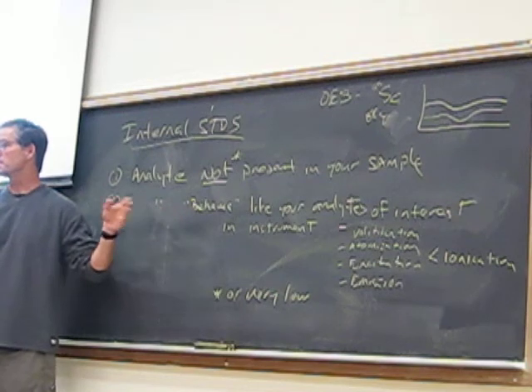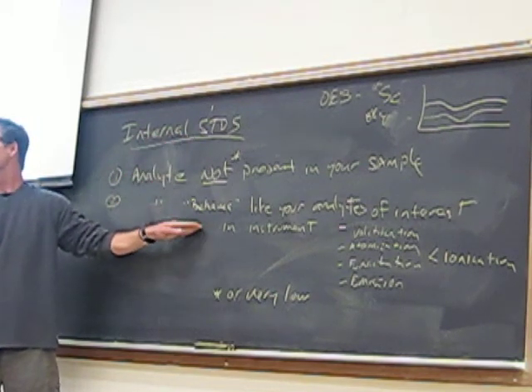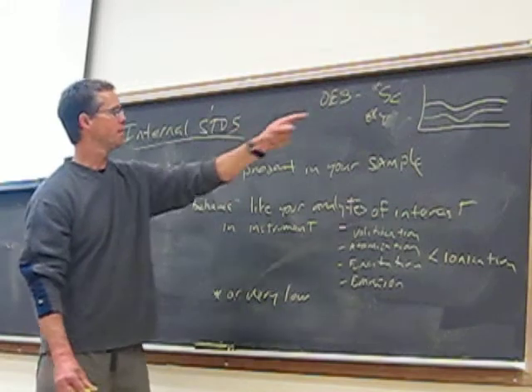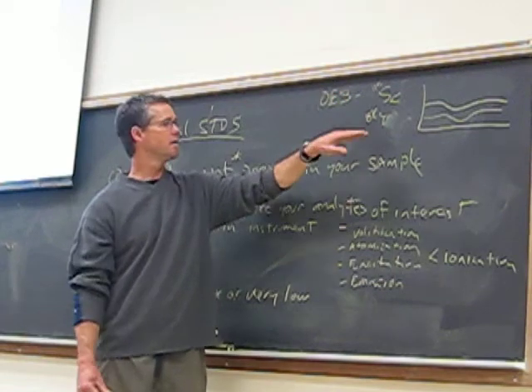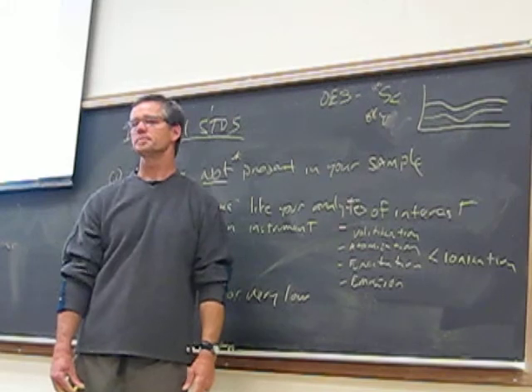There's some analytes that behave very differently from each other. And it's a process for matching which internal standard I would use to match to my analyte. Depending on which analytes I use, I use a particular internal standard. So for you, measuring transition metals, most of you, that's why scandium's there, right? But if you're measuring much heavier elements, like lead, then we use yttrium. The elements like yttrium. All right.